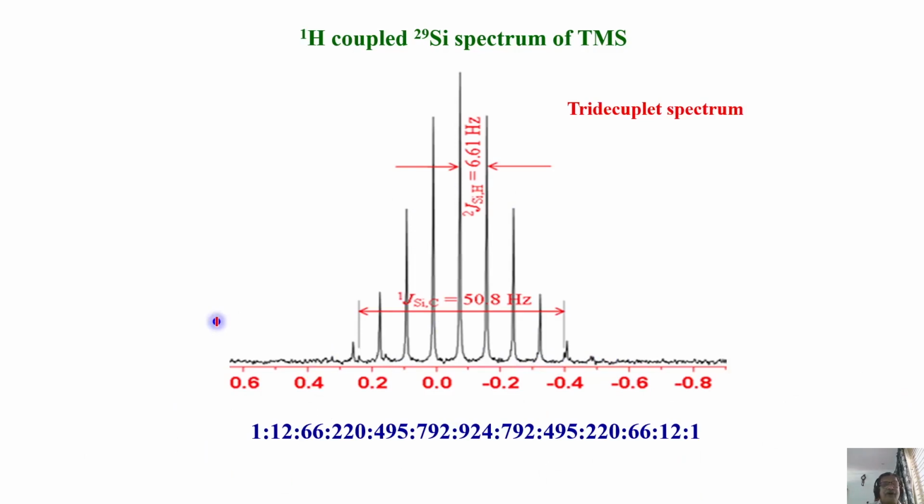You understand? So, I am just quickly going through lots of nuclei. Many spectra can be analyzed. Basically, what you need is a foundation for analysis of the proton spectrum and carbon spectrum, and how they are coupled. And another thing is that there are dilute spins coupled, like weakly abundant spins. I told you it appears as a satellite. And you should know how to analyze the satellite spectrum. The classical example is dimethyl mercury.